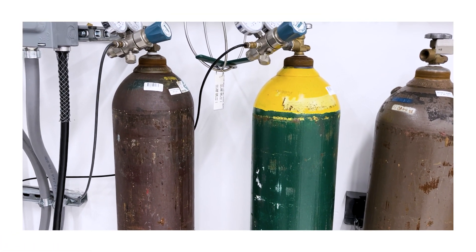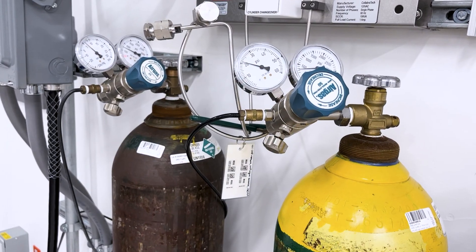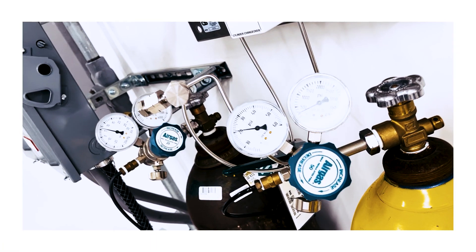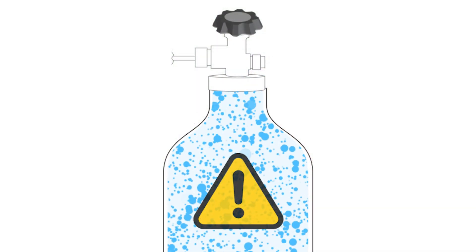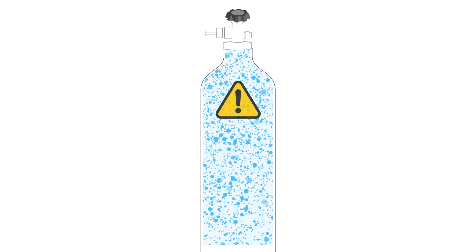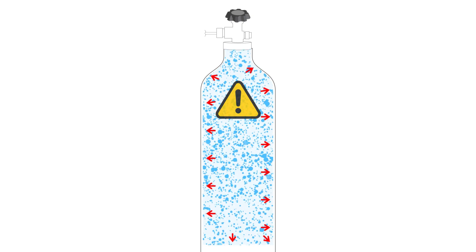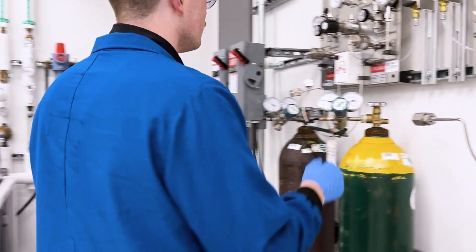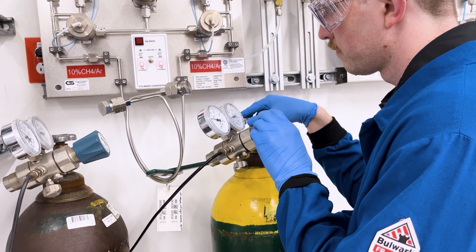Gas cylinders are ubiquitous across USC laboratories, and this ubiquity may engender a lack of appreciation for the hazards they pose. High-pressure gases are extremely hazardous. Even for gases which don't have significant chemical hazards, they are still dangerous when under pressure because of the tremendous stored energy they contain. Therefore, it is of paramount importance that users properly select, maintain, and operate equipment used to handle high-pressure gases.